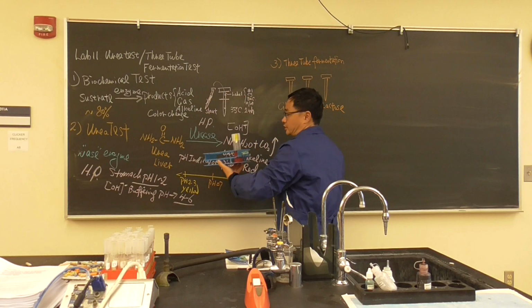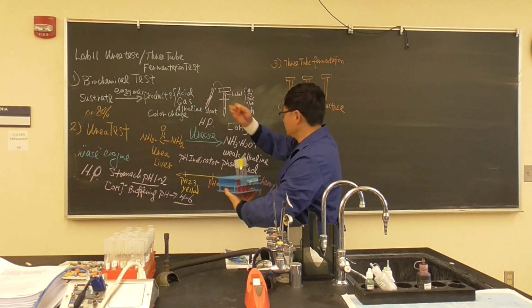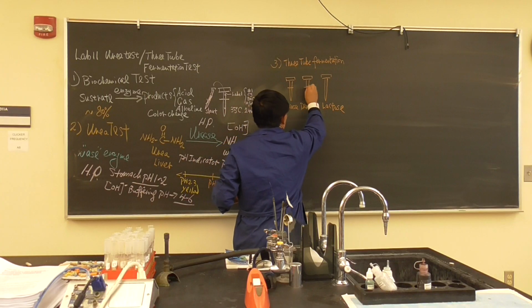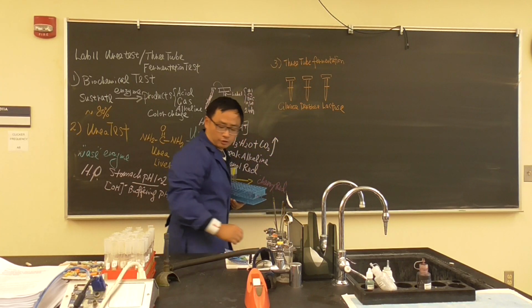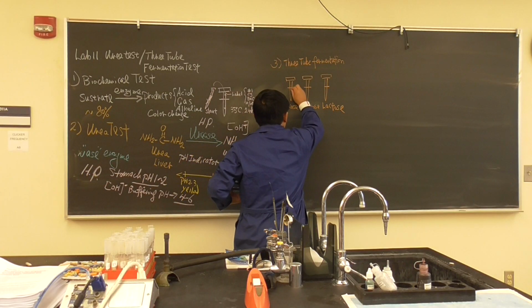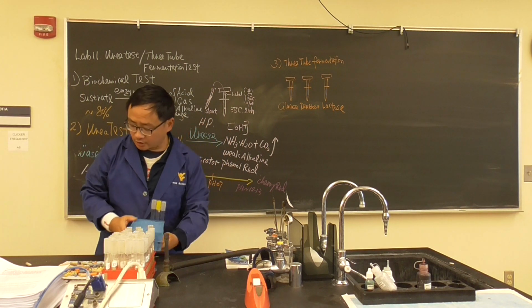And you have to label them very well. One of them we use a yellow cap, but it goes in order. They have a bacteria, they have a solution there. Inside there is also another tube, looks like this. If you are careful, you can see it. So we want to talk about these things.